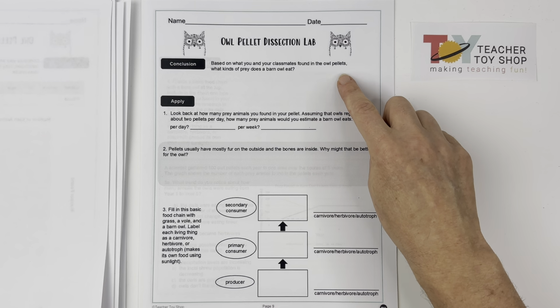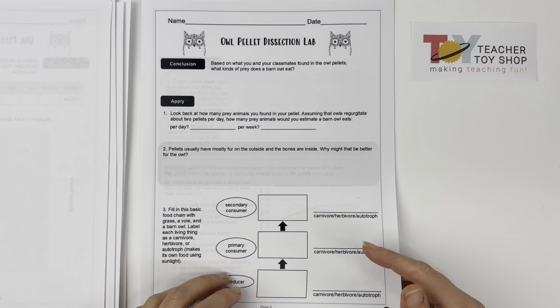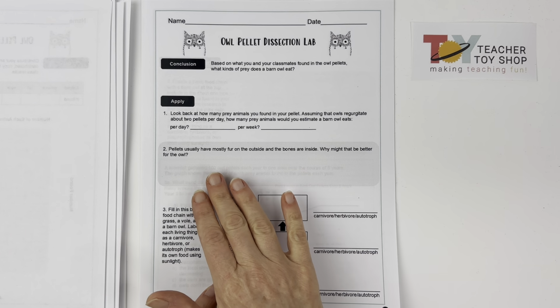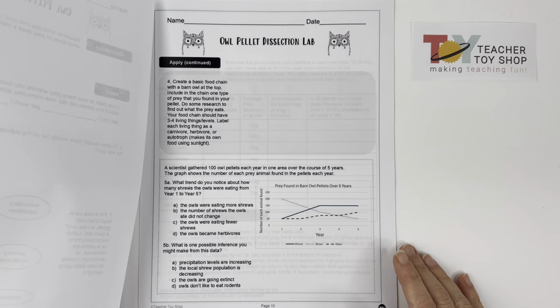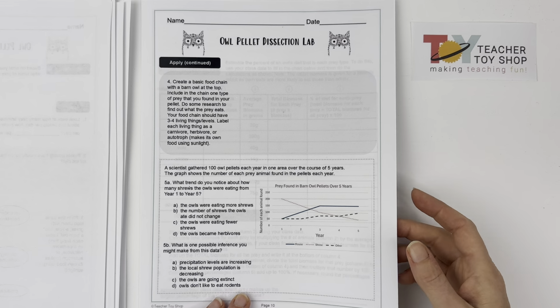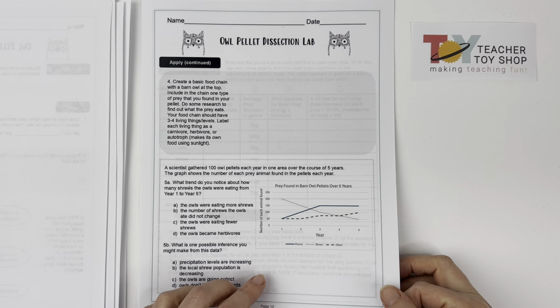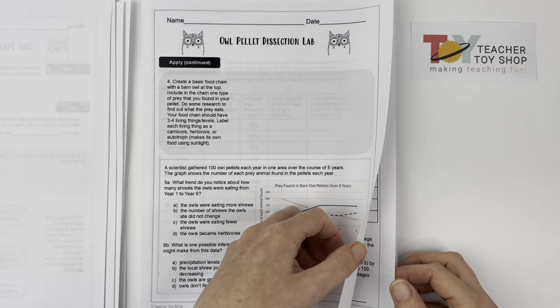Then there are conclusion questions about what they found in the pellet, and application questions about the things that they saw, predator-prey relationships in food chains, and reading a line graph and understanding how owl pellets can be used to understand the wider ecosystem in which barn owls live.